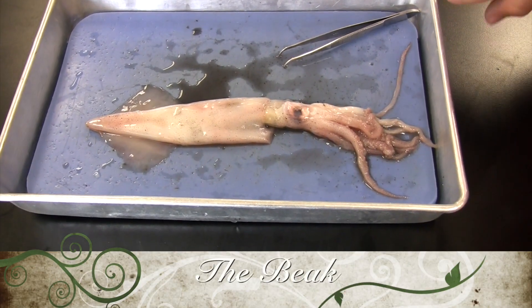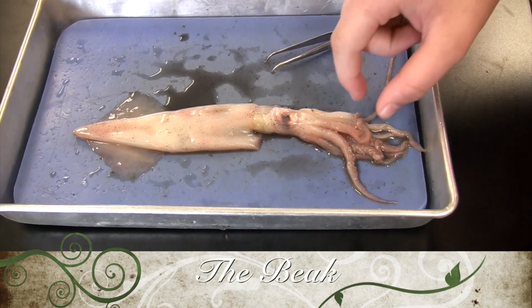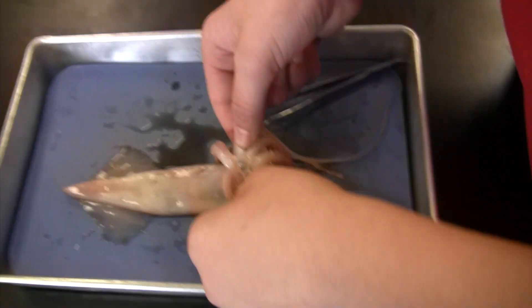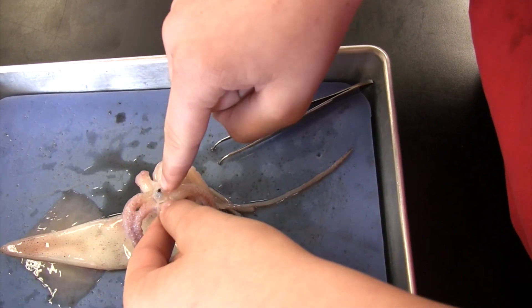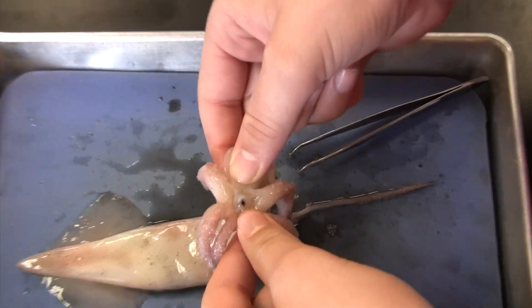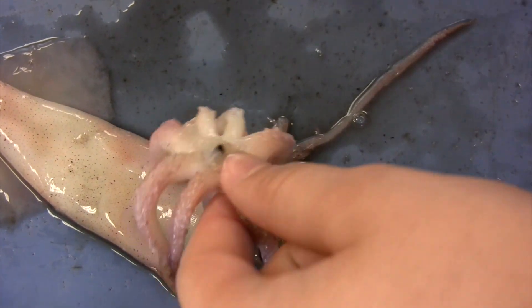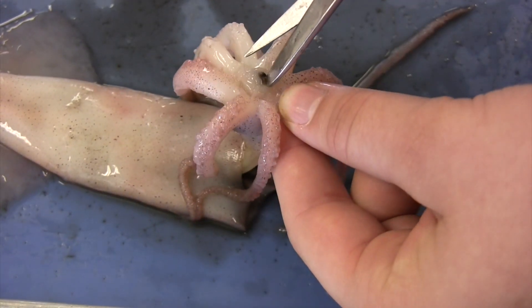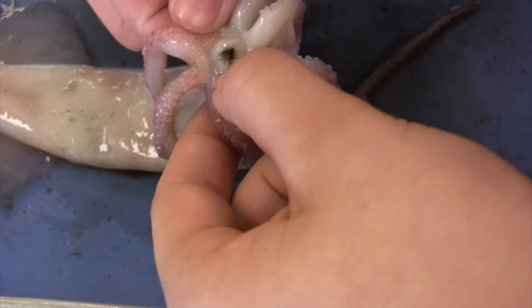Now I'm going to show you how to remove the beak. First, you want to move the tentacles and sort them out like that, and it helps to tilt it up some. The black thing right there is the beak. It helps to spread — I'll grab scissors — and sometimes when they're dead their muscles clench, so it's hard to get in there. You make wide cuts on both sides, and it's a lot easier to get it.